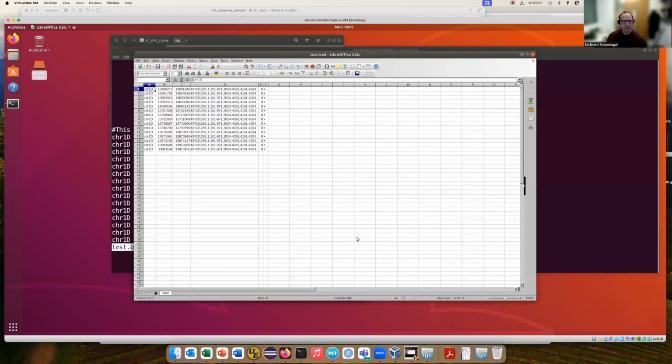Let's load that. And remember, I said if you want to have one of the subsequent columns, you need to have entries in all of the others. The other entries right in front of us are thick start and thick end. This is if you want to display any UTRs or something, but in this case, we just start from the beginning. We copy and paste our normal start and end position as thick start and thick end.